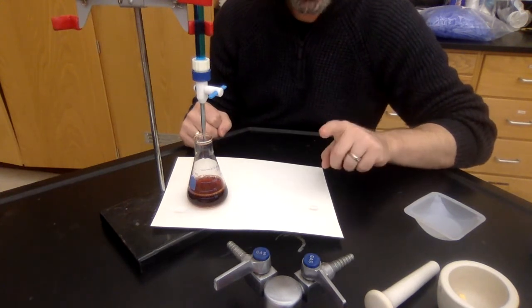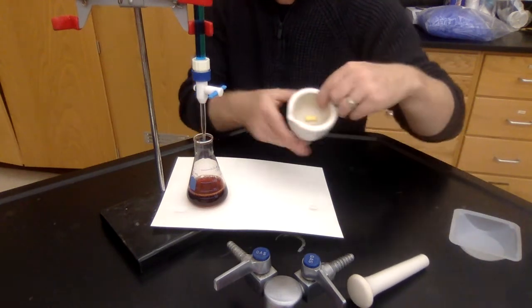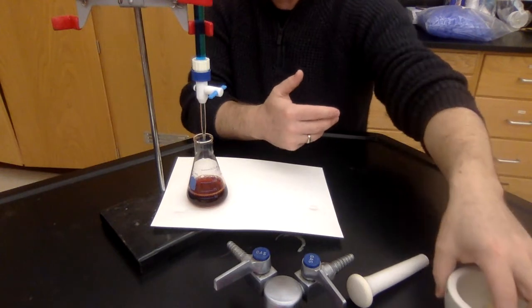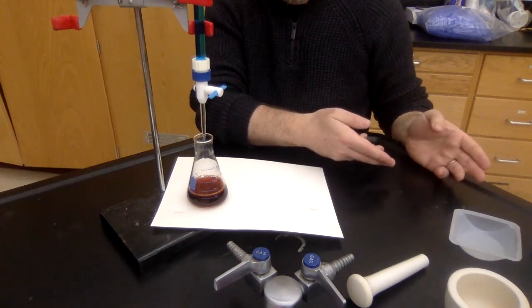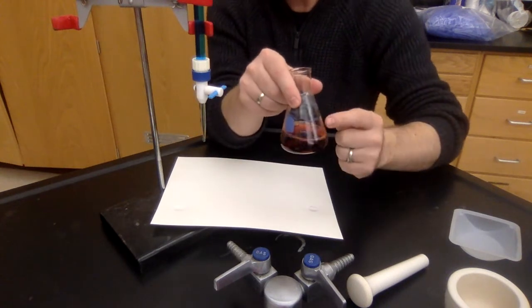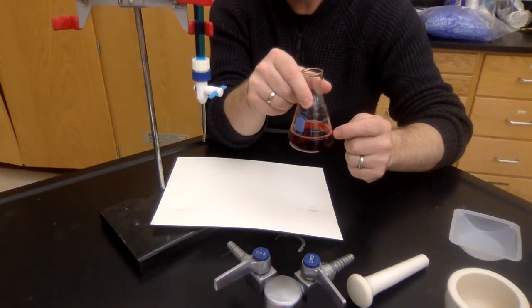So on day one, just to reiterate, on day one, you're going to grab one of these things, you smash it up, you figure out how much powder is in there, how much vitamin C, and then you're going to load up a sample so that you think you're going to use 25 milliliters of your titrant.